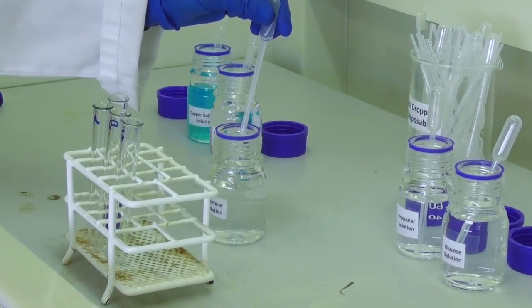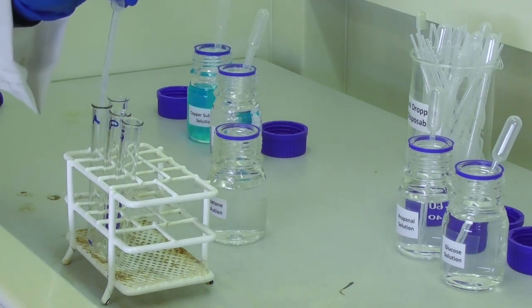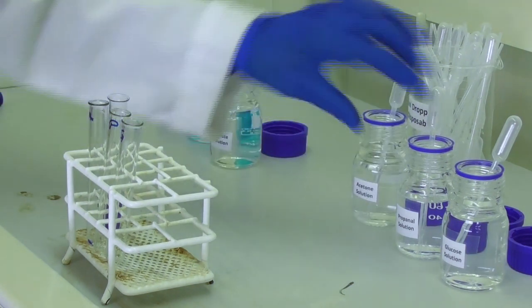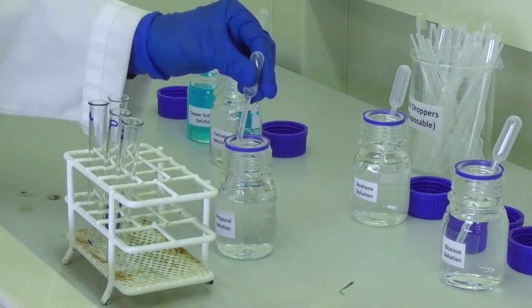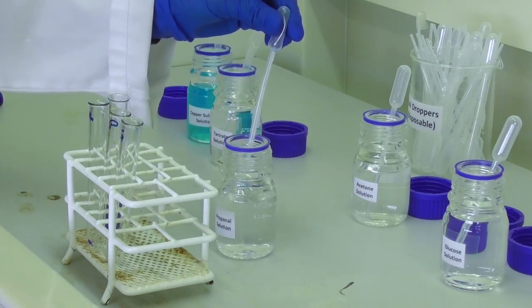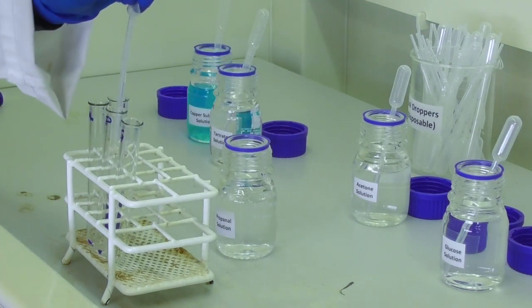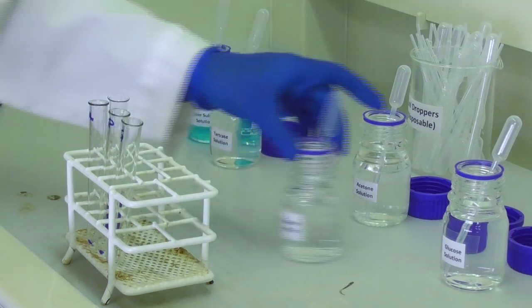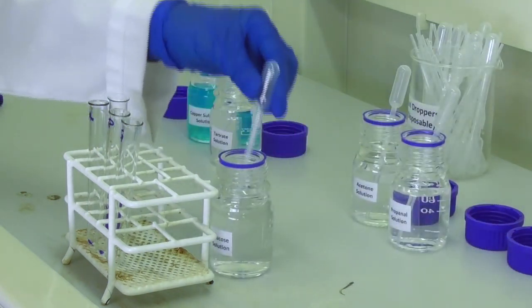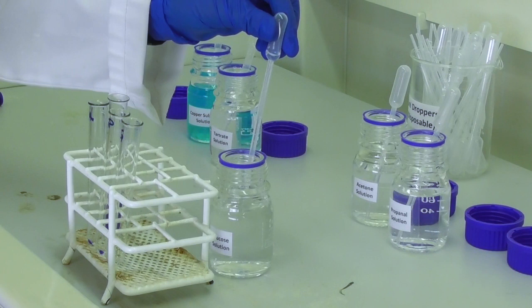We dispense one milliliter of acetone into the first test tube, one milliliter of propanol into the second test tube, and then one milliliter of glucose into the third test tube.